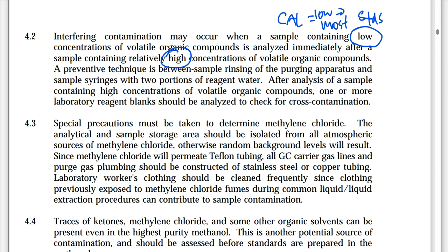Sometimes the high standards make it a little too dirty, and not everything is flushed out, not everything is cleaned, and by the time low concentrations come in, they are contaminated in a way by what has happened in a previous run. So here is the method's way of saying this can also happen to samples as well. If you know something about the samples, please run them in that particular order, but a lot of times we just don't know. We're just taking run-of-the-mill samples, loading them up the way that we want to load them up, and seeing what we get at the very end.